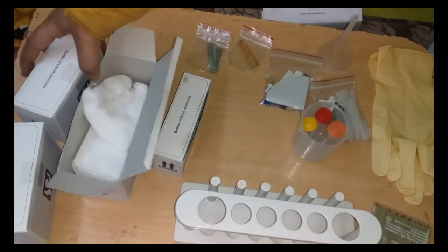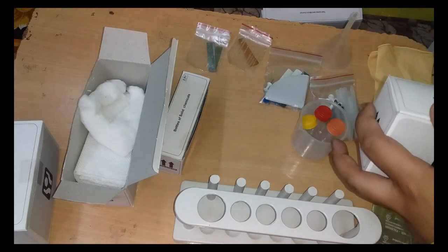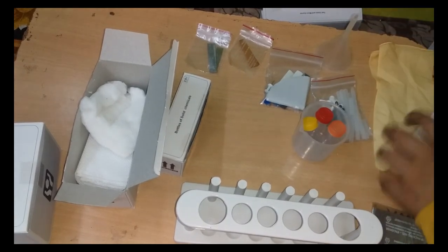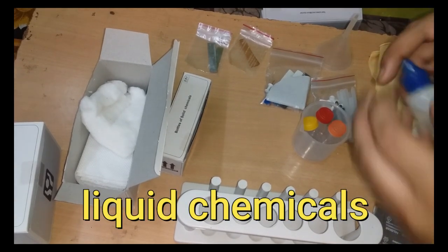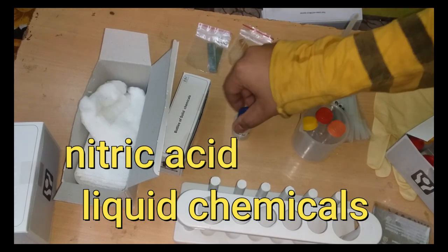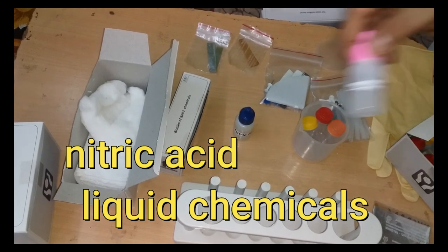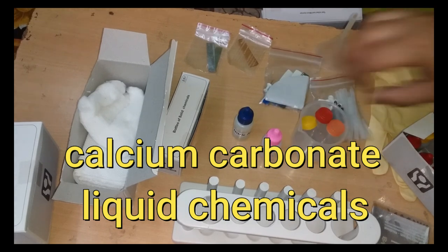Now I'll be unboxing the bottles of liquid chemicals. You see, they're less but more quantitative. This is nitric acid and this is calcium carbonate.